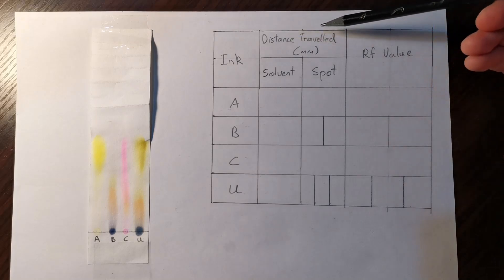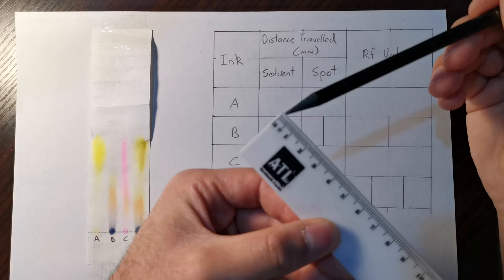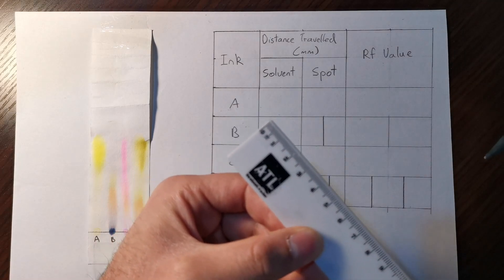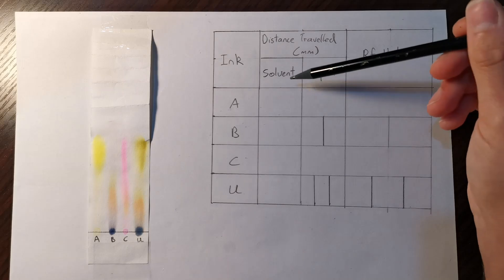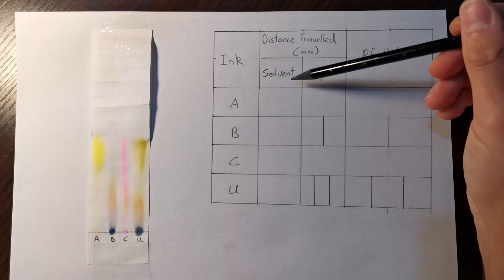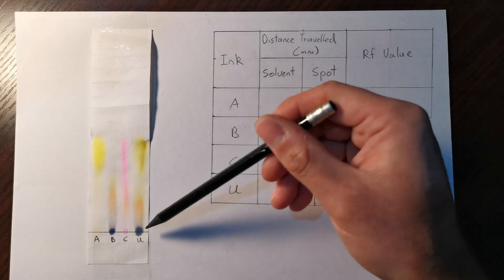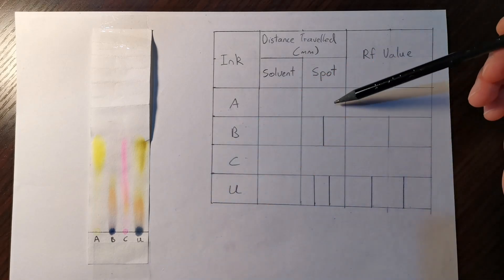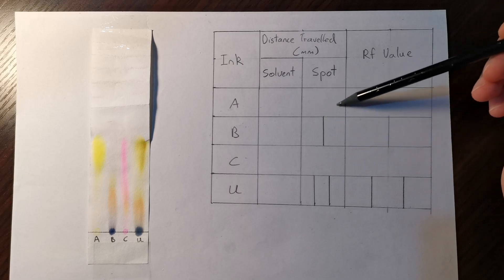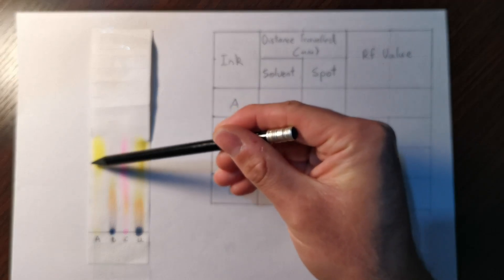The next column is the distance traveled in millimeters — we're using millimeters, which are the small segments on the ruler, not centimeters. You need to measure the distance traveled by the solvent, which in this case was sodium hydrogen carbonate — you can use other solvents like water or propanone. You also need to measure the distance traveled by each spot. Some inks are made of more than one spot. Ink A, the yellow, only contains one spot, so it's pure.